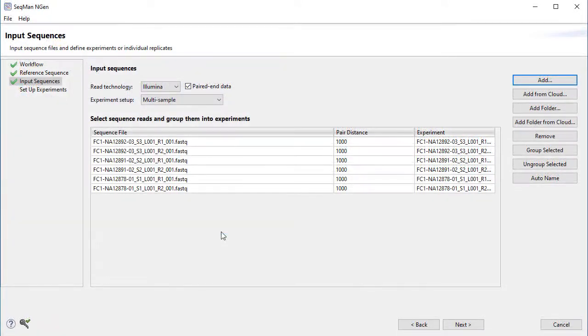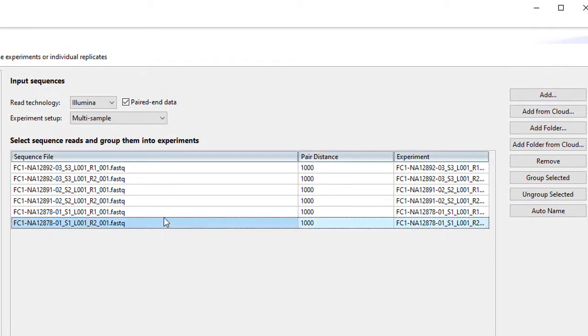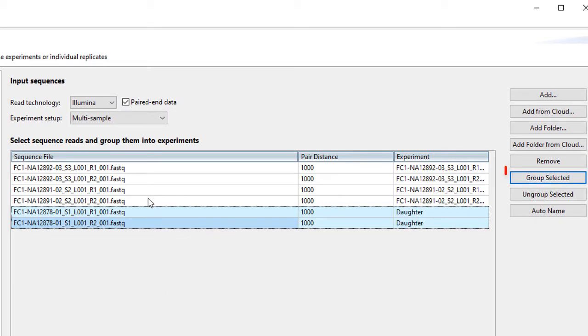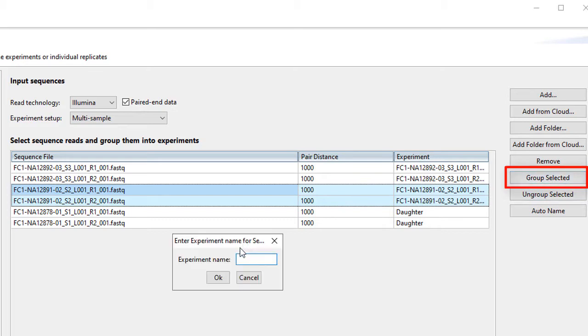I've loaded data from three samples, so the next step is to group them. To do this, I'll select the reads that are part of each sample, then click Group Selected, and name each experiment.